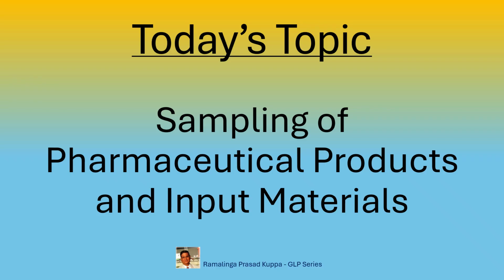Today's topic is sampling of pharmaceutical products and input materials. Sampling procedures are very important to evaluate the huge quantities of pharmaceutical products and its input materials.